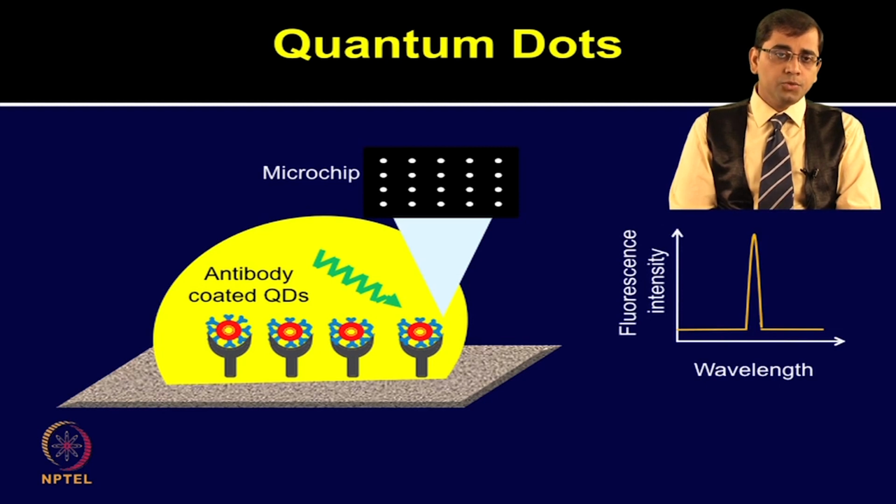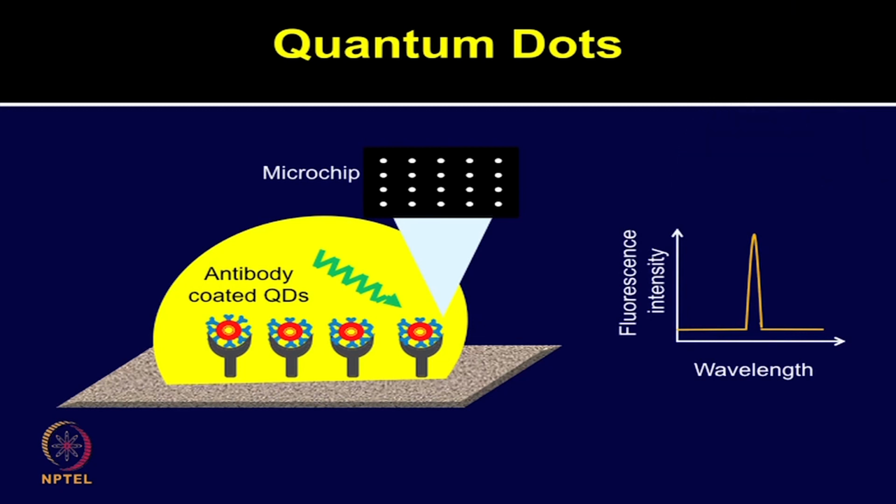The excitation of a QD with incident light leads to formation of excitons due to the absorbance of a photon with higher energy than the band gap of the component semiconductor, and this fluorescence intensity is measured as shown on the right hand side of this graph. The smaller the nanocrystal, the higher the energy level that can be reached.